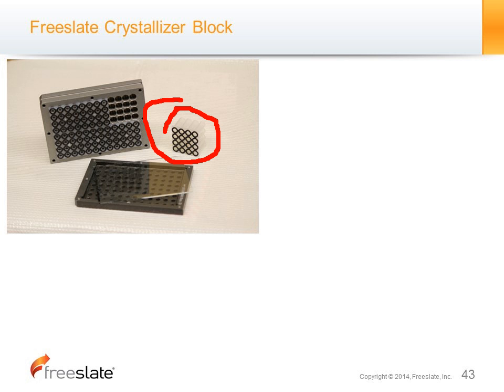We just ordered that from a supplier. It's just simple steel balls. It's not something special. And the size of that well, in terms of dimension, I have to get back to you. I think it's roughly a 9 millimeter pitch center to center, is it not? Could be. Yeah. Okay.